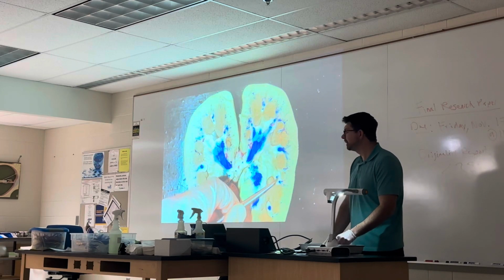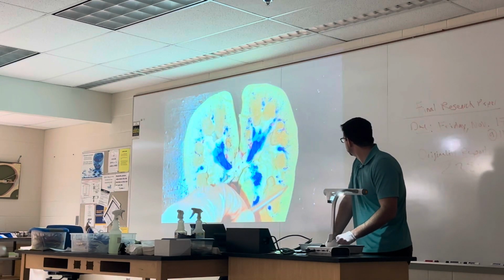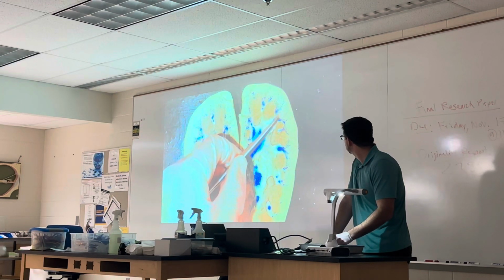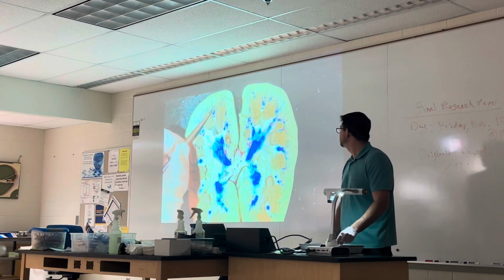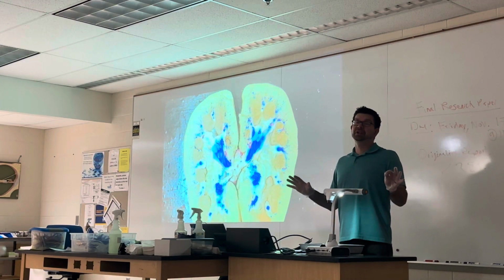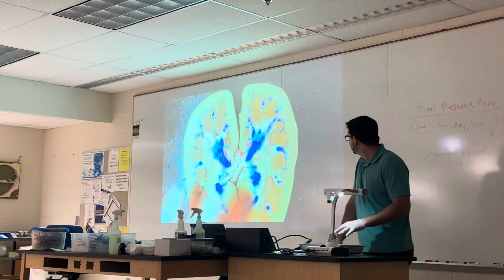You also have blood vessels going through that connective tissue of the kidney. So right here would be a renal column, right here's a renal column, over here a renal column, and over here. So if you see a pin between the renal pyramids, like right here, you're like, okay, NITS wants the renal columns. So you'll know that's what I'm looking for on the pig kidney.